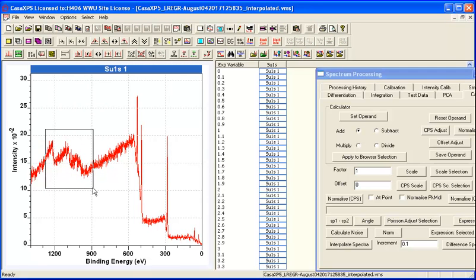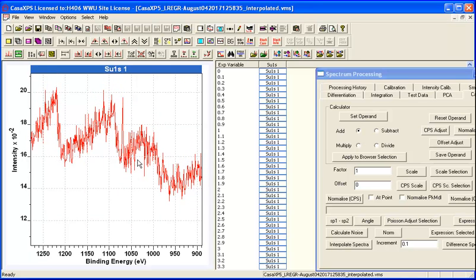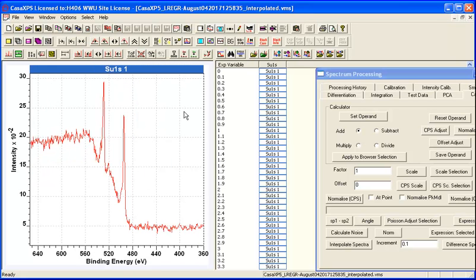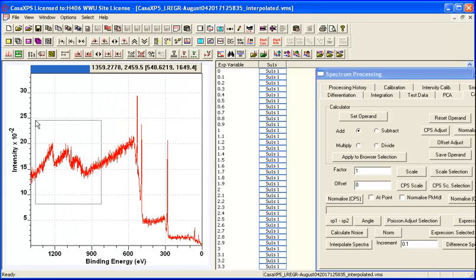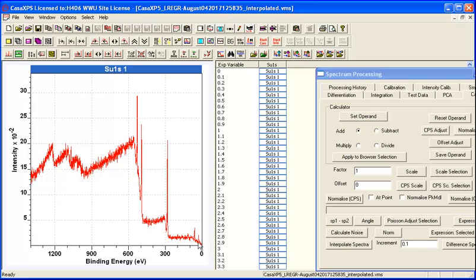So what I'm doing is I'm just trying to see what kind of influence the sodium is having. So that's the sodium 1s. And you can see there's an Auger peak here. So the fact there's a sodium Auger peak, when I've managed to remove the sodium 1s, well, this is characteristic of that first spectrum, and the quantification of the first spectrum did show that there was an anomaly between the sodium 1s and the sodium 2s.